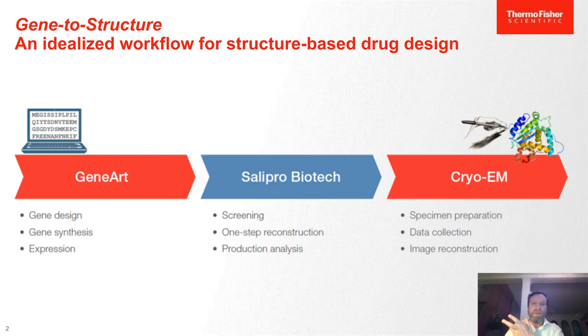Then, of course, we turn the electronic data into a tangible molecule through gene synthesis and the transfection into mammalian cells for their expression. The next step in our collaboration is then with Salipro Biotech, who is specialized in one-step reconstruction and purification of the membrane proteins from the cell pellets that we send them, and they screen them and do the production analysis, of course.